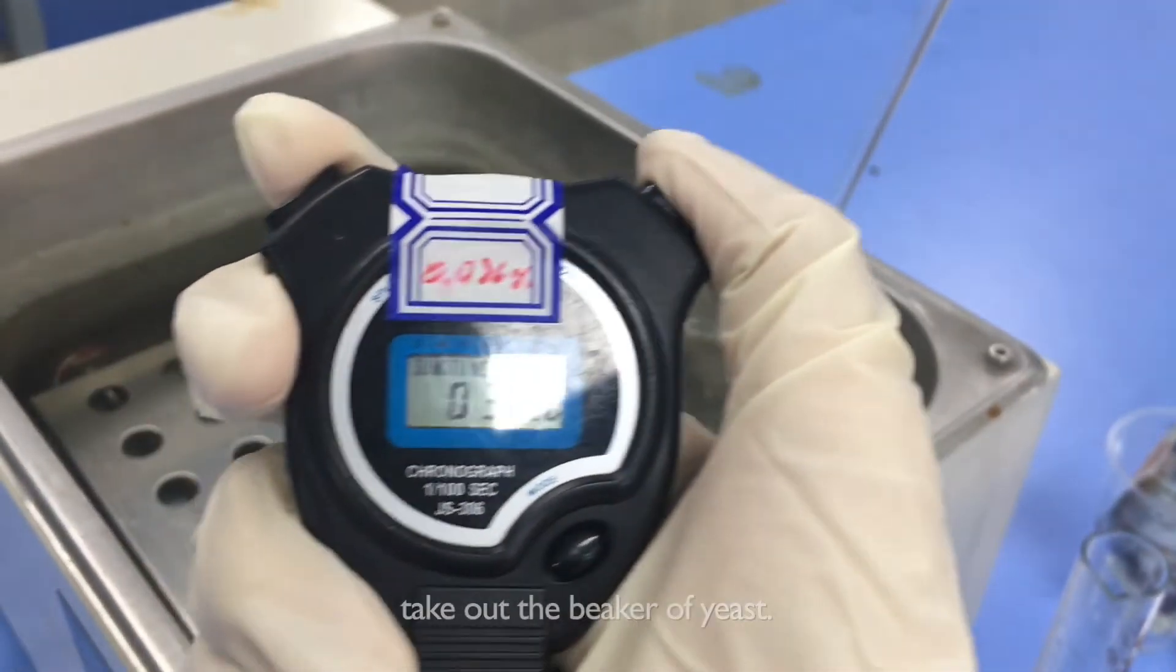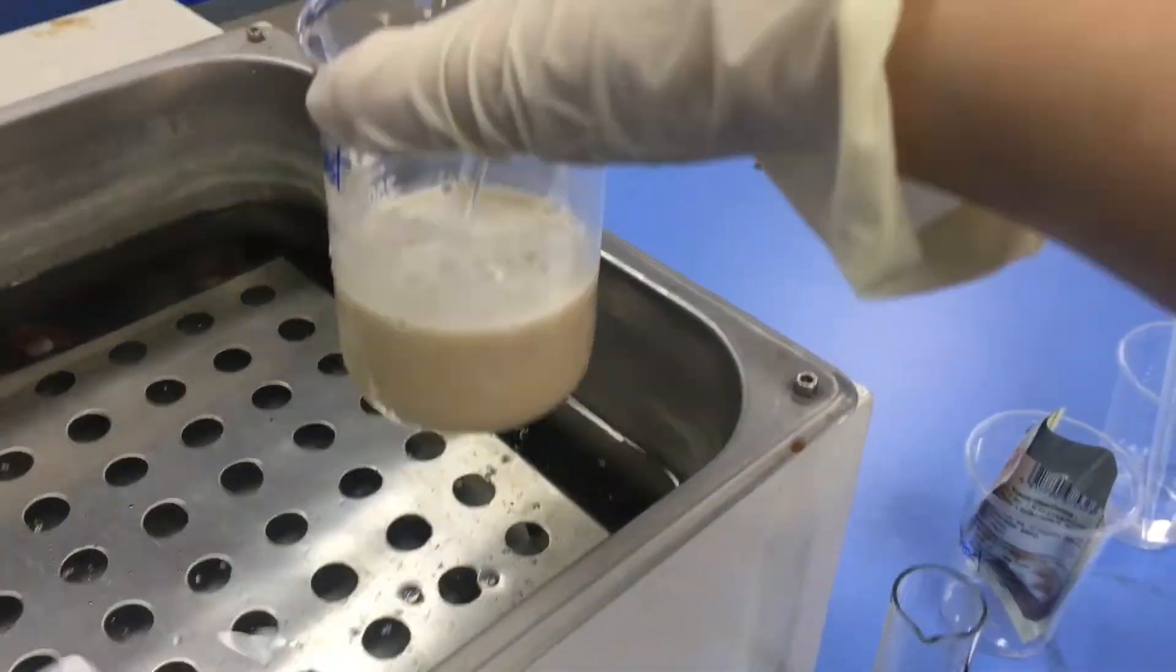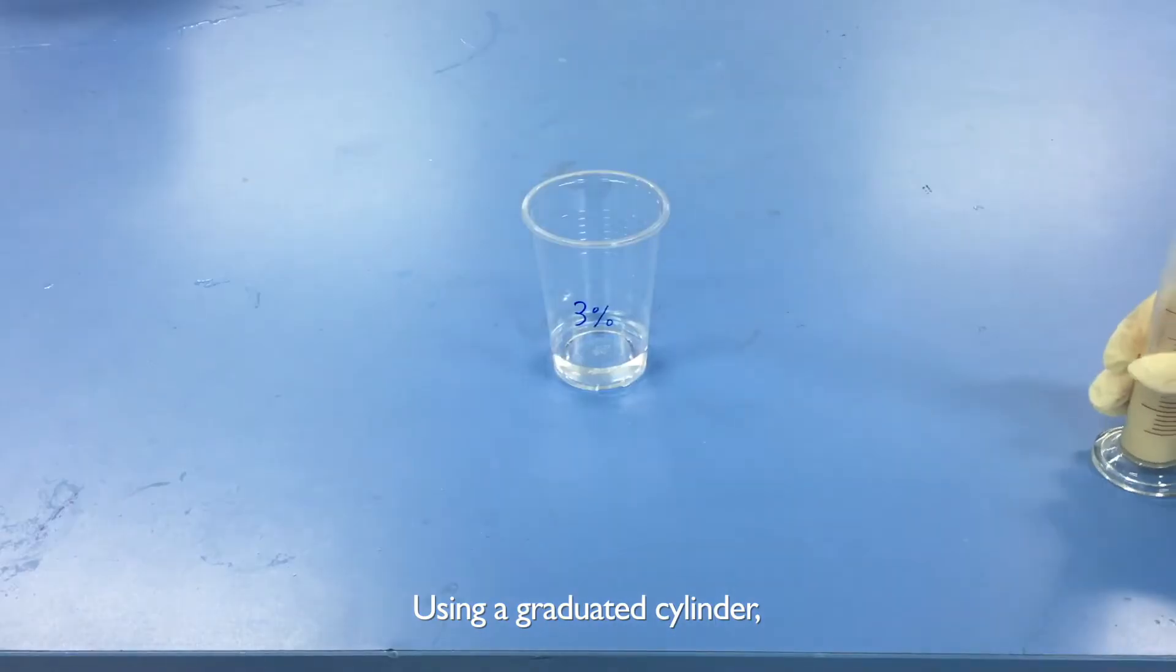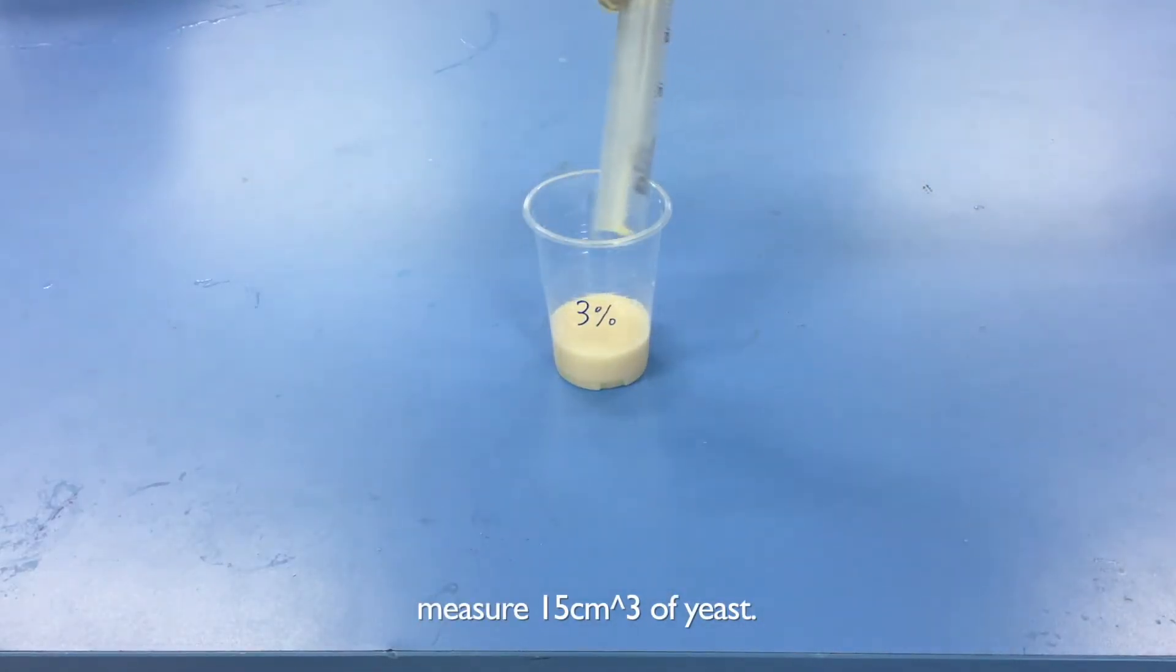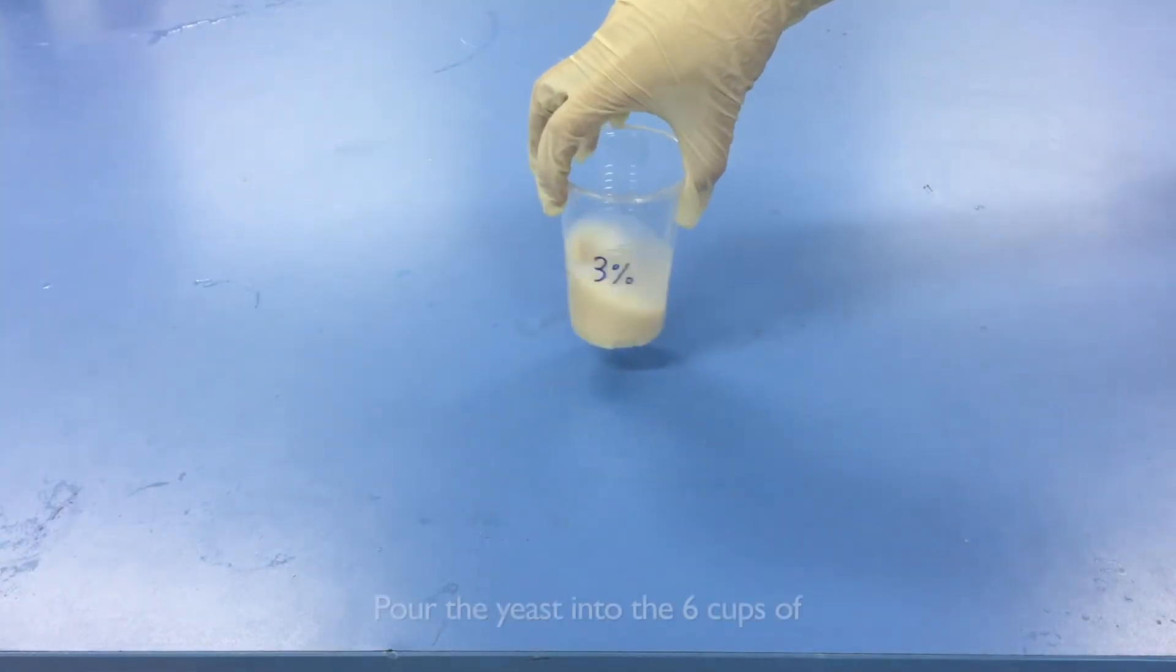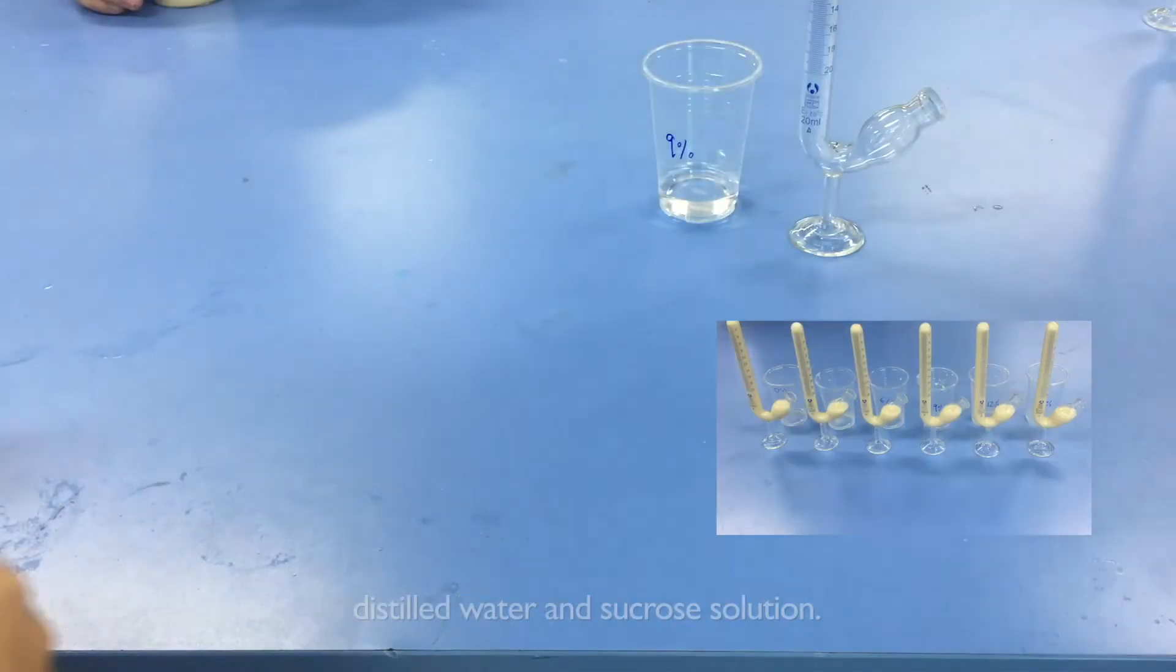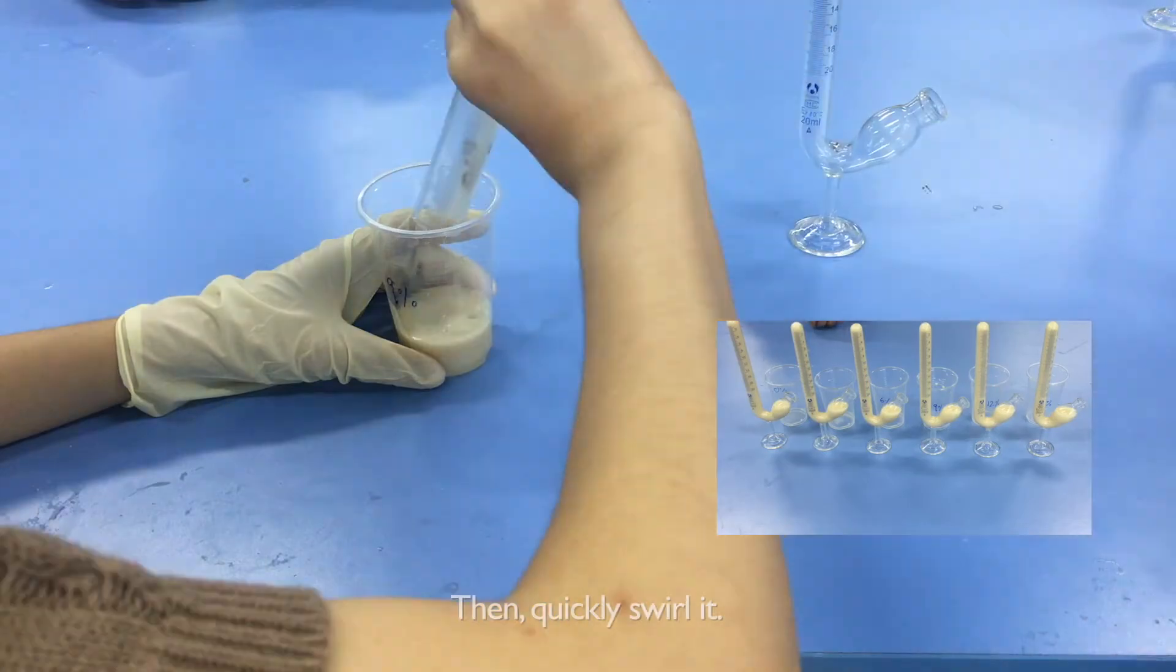When 30 minutes has passed, take out the beaker of yeast. Using a graduated cylinder, measure 15 cubic centimeters of yeast. Pour the yeast into the 6 cups of distilled water and sucrose solution and quickly swirl it.